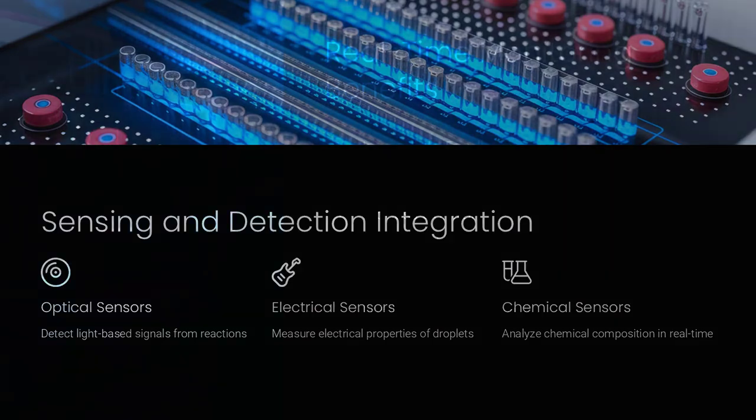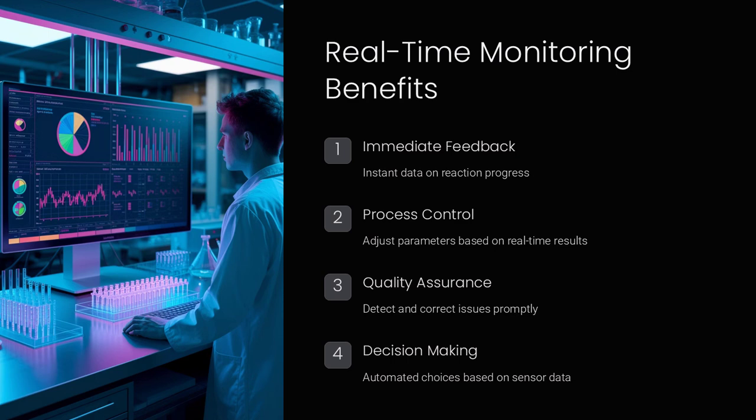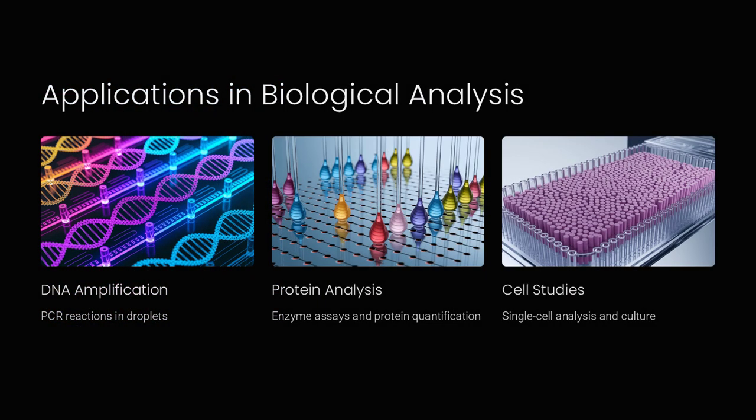Digital microfluidics automates complex laboratory workflows by integrating various steps such as mixing, incubation, and analysis on one platform. The automation minimizes human error and speeds up experimental processes, with sequential and parallel operations programmed to occur without manual intervention. This integration reduces the need for bulky, multi-dependent laboratory setups, thereby enhancing reproducibility and efficiency in experimental procedures.